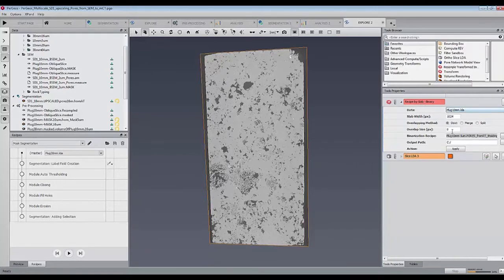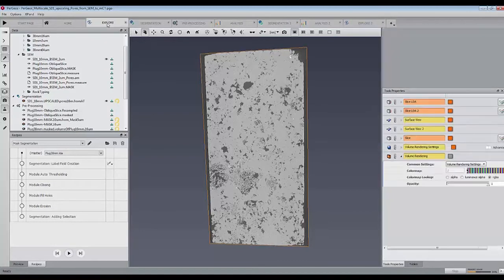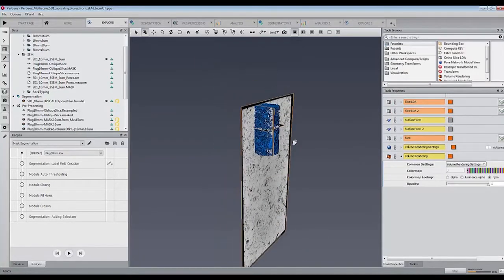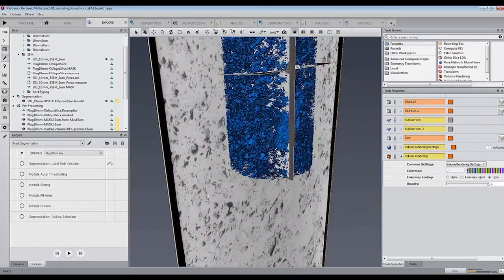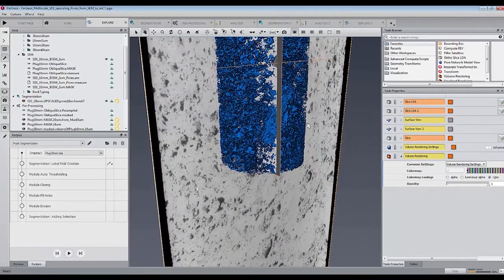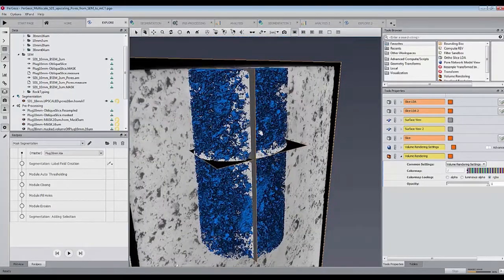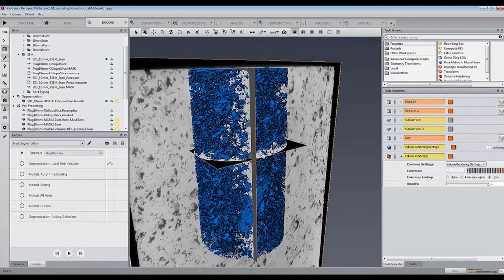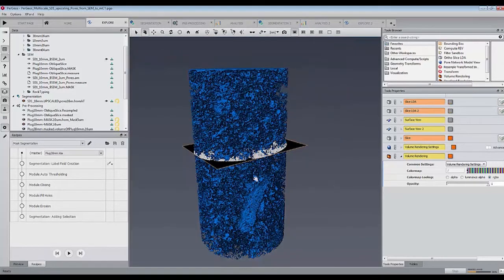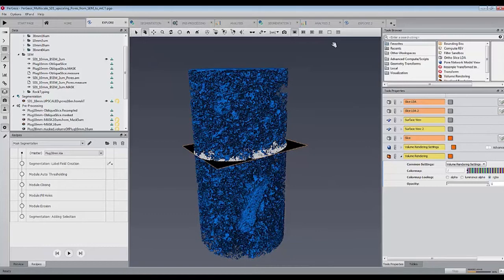We will use the slab processing modules to extract the pore space thanks to a recipe including the thresholding with the previously obtained value in order to avoid a memory overflow. Once it is applied, we get a 3D pore space that can be visualized with volume rendering.